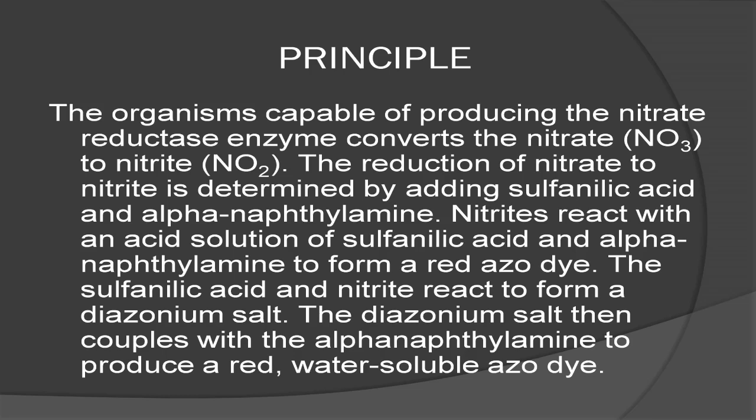Thus, when nitrite is not detected, it is necessary to test if the organism has reduced nitrate beyond nitrite. This can be done indirectly by adding some amount of zinc powder to the culture. The addition of zinc reduces the nitrate to nitrite, and the nitrite in the medium forms nitrous acid, which reacts with sulfanilic acid. The diazotized sulfanilic acid thereby produced reacts with alpha-naphthylamine to create the red complex.